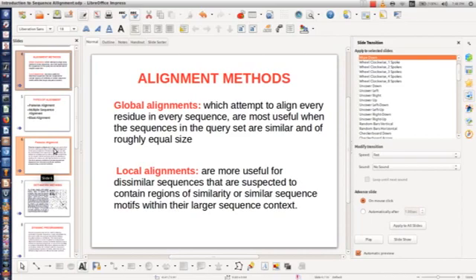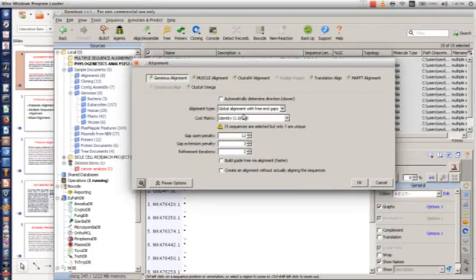So we'll be working on global alignment, since we're working on multiple sequence alignment. So global alignment with free end gaps. The essence of free end gaps is that once you're aligning the sequences, the beginning and the end of the sequence have a free gap. You're just saying alignment should not be penalized in those end gaps, so you're looking for conserved regions that are highly similar for alignment and comparison.